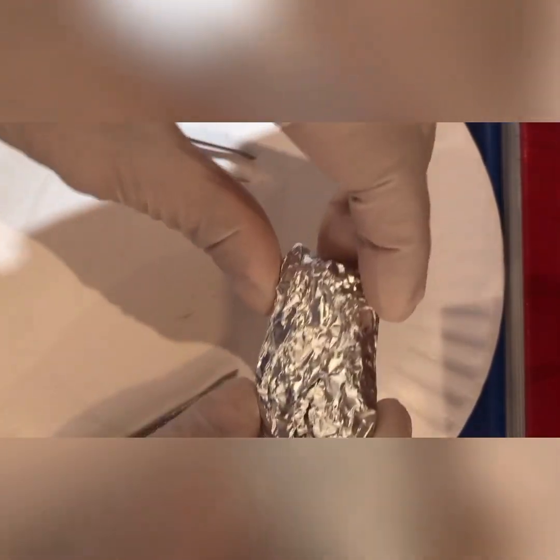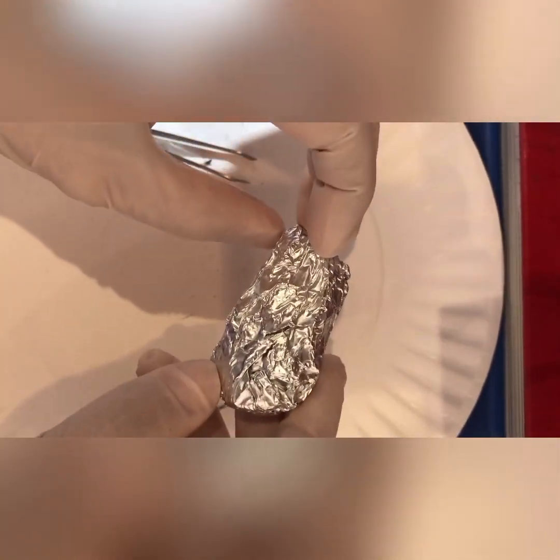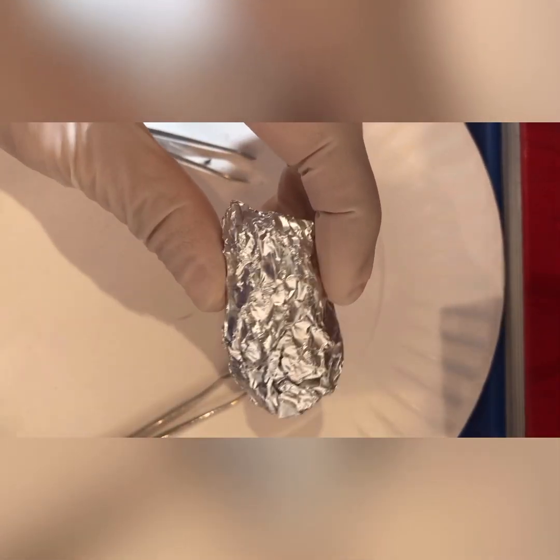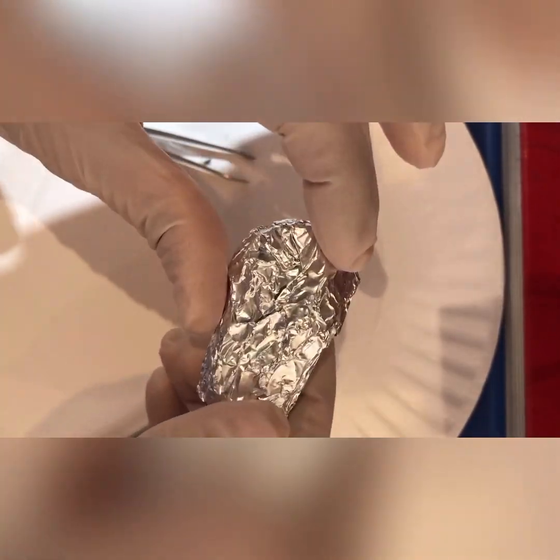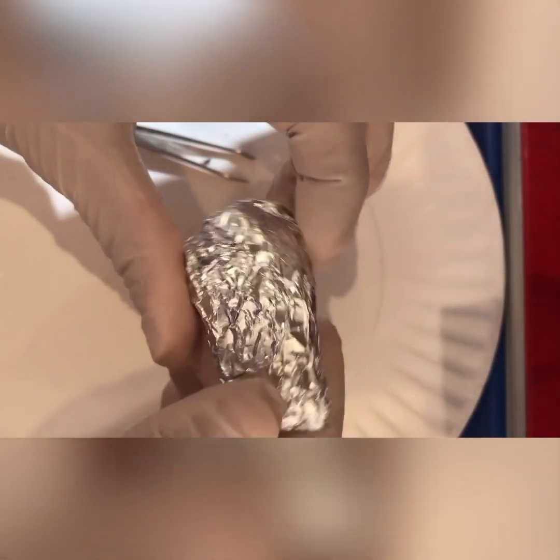What I have here is an actual owl pellet. This owl pellet is not one that I found, but one that we purchased from a scientific supply company. I don't need to be wearing gloves, but I am, just to be extra safe. The owl pellet is wrapped in aluminum and it's fumigated, so it's actually safe to touch.